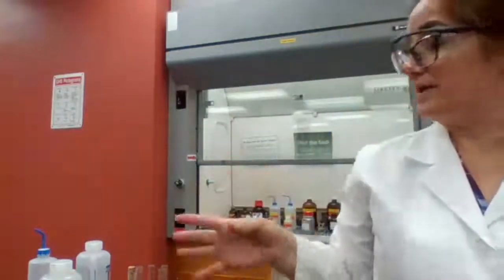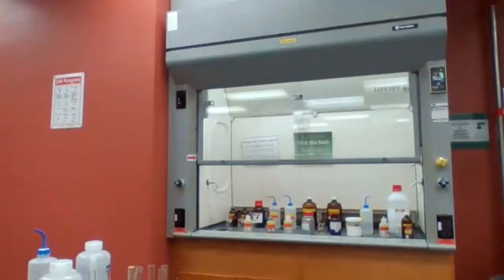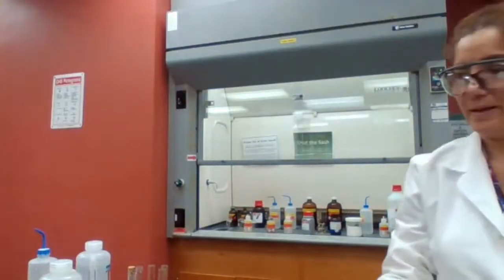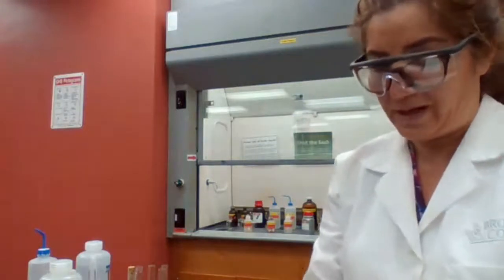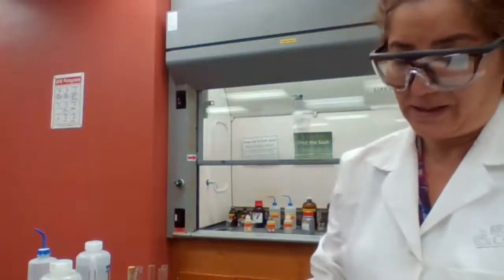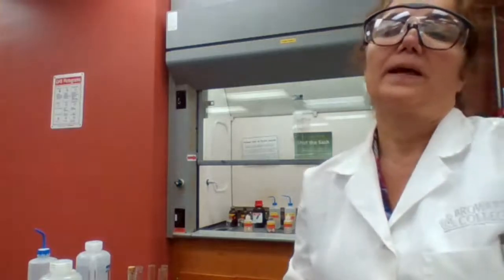Silver nitrate leaves a black stain for a long time, so I touched that solution that contains silver nitrate. I had to wash it right away, and if it happens to you, you should wash it right away, because if it stays on your skin, it will leave a black stain for a long time.